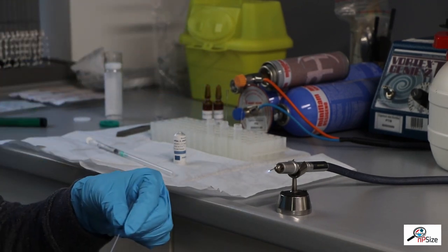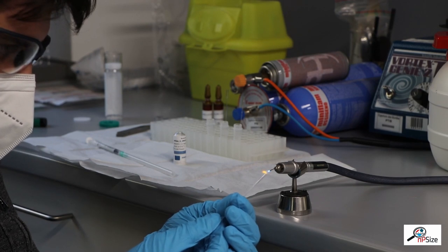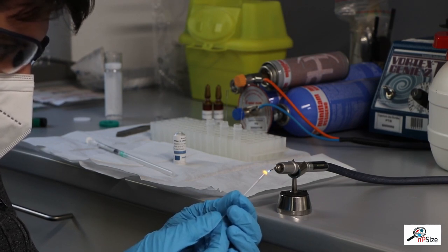This allows us to melt the glass and tightly enclose the sample so that it can be put into the vacuum without evaporating the sample.